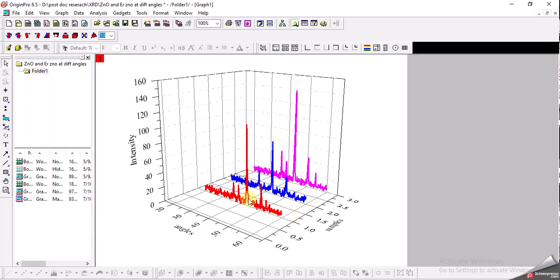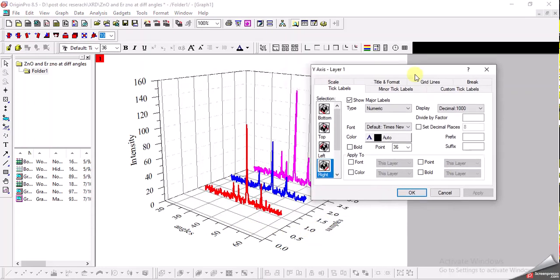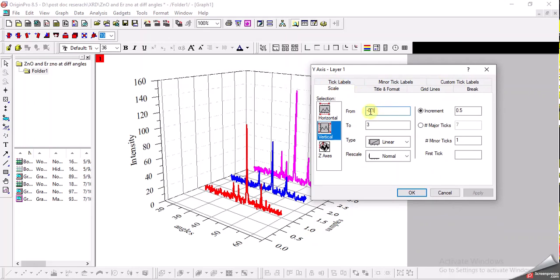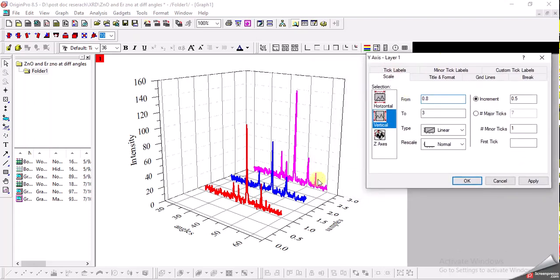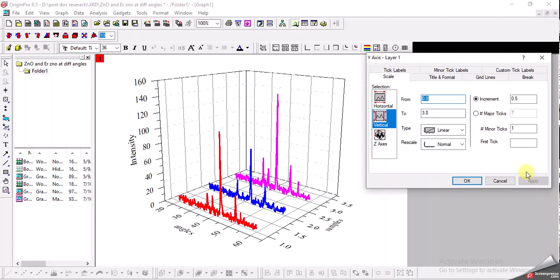I also want to move the plots closer to the axis, because there is empty space that doesn't look good. So I change the scale - it's starting from minus 0.1, so I can set it to 0.8. I also increase the upper limit and set it to 3.8. Now it looks good.